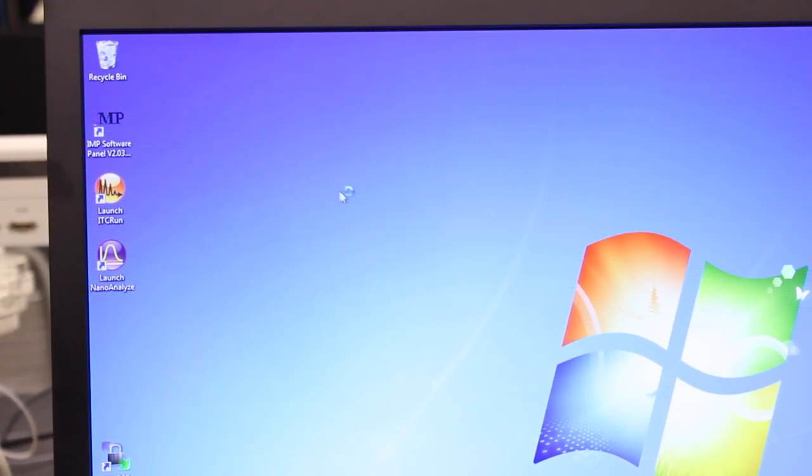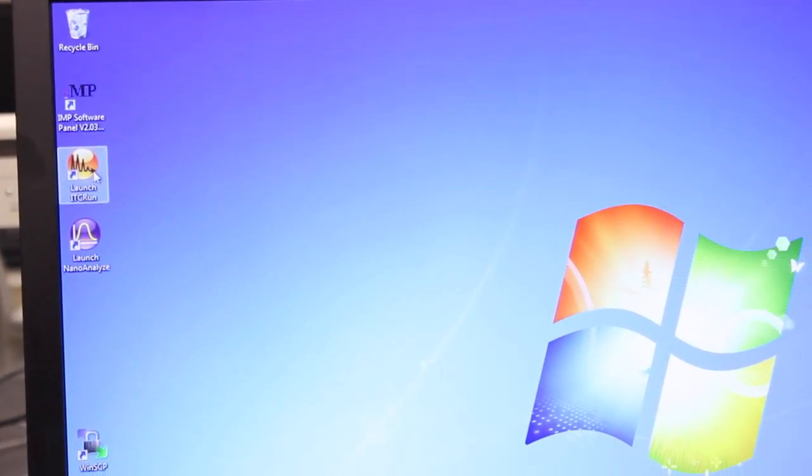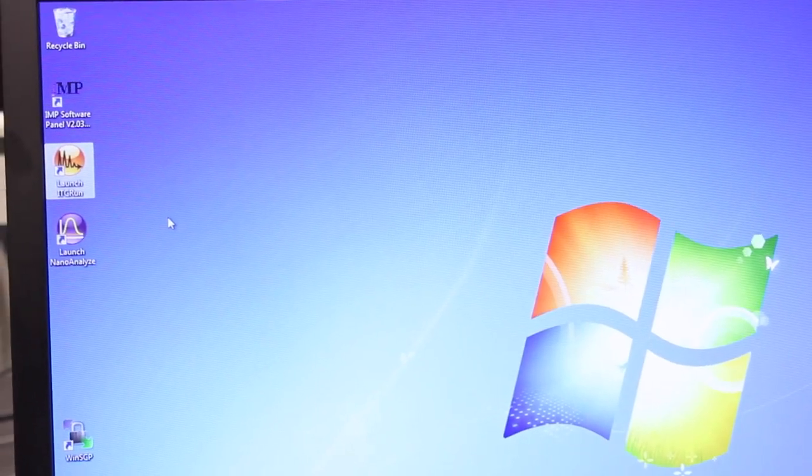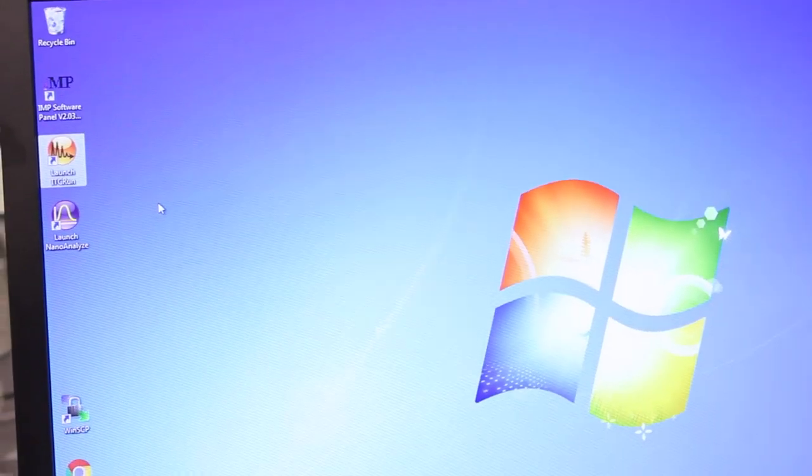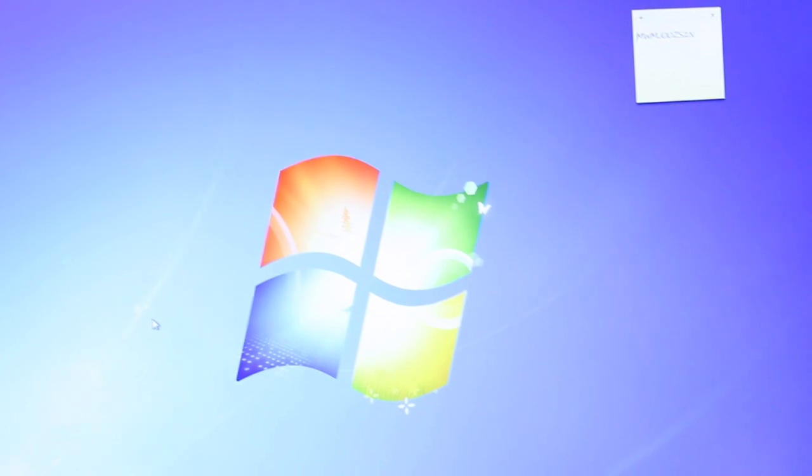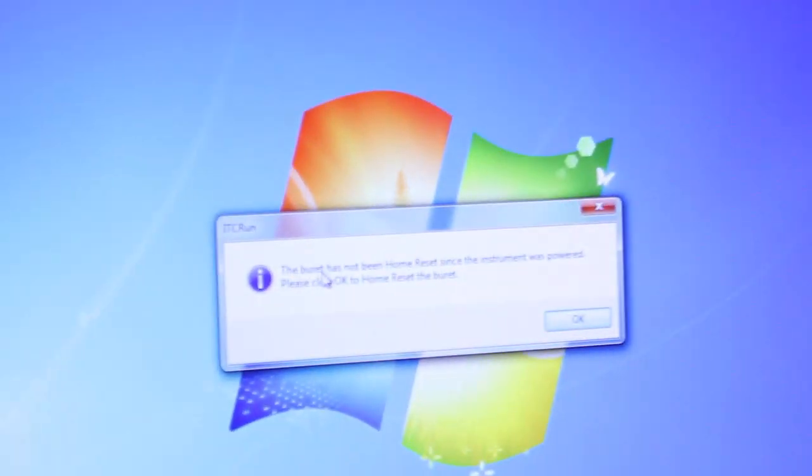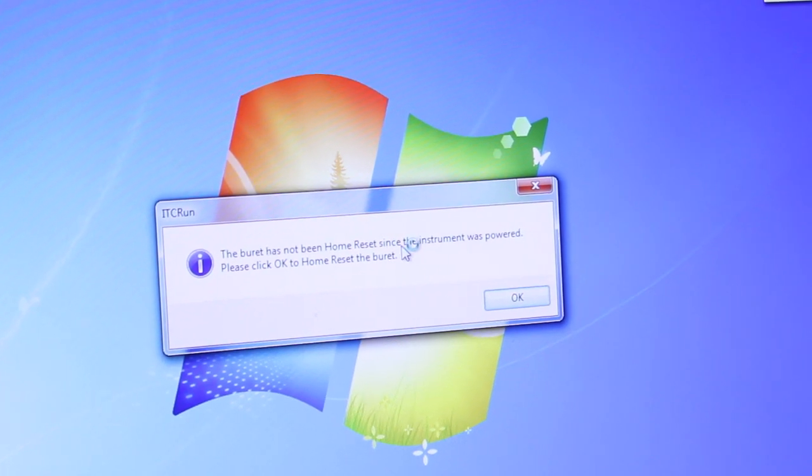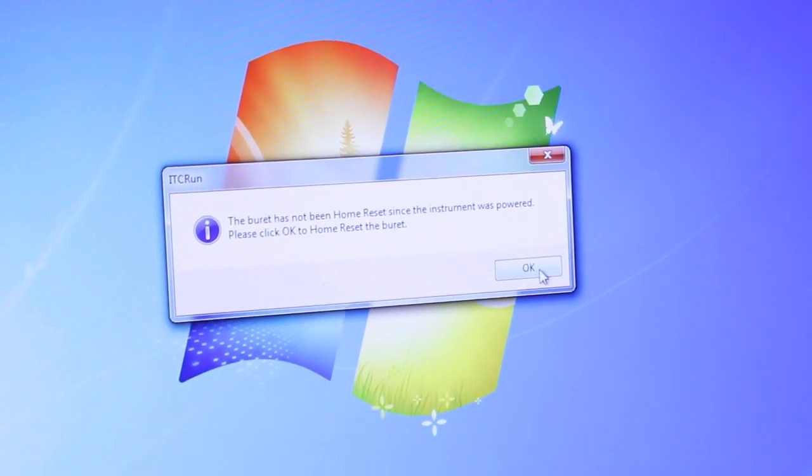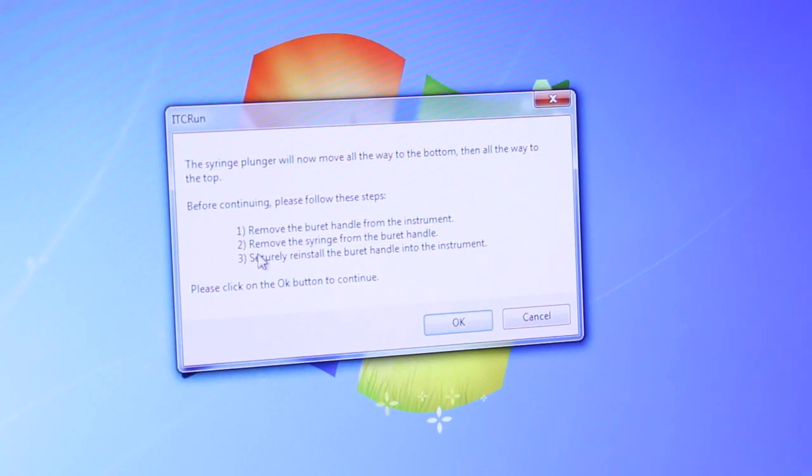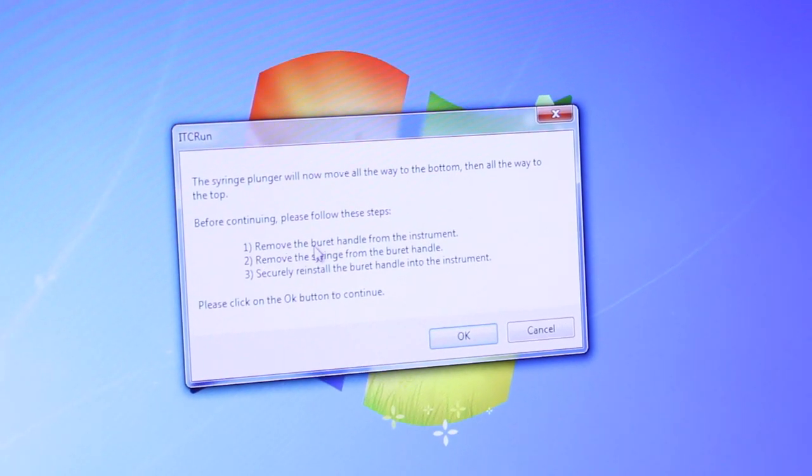After you log in, you're going to launch the ITC run program. It will come up with a window telling you that the instrument needs to have the burette be home reset, so click the OK button, and it will give you instructions about how to allow the home reset procedure to occur.